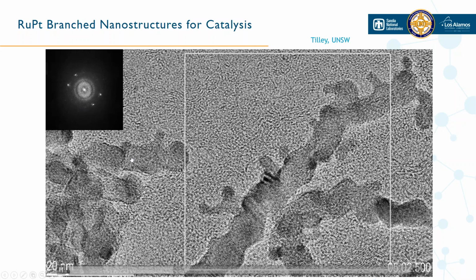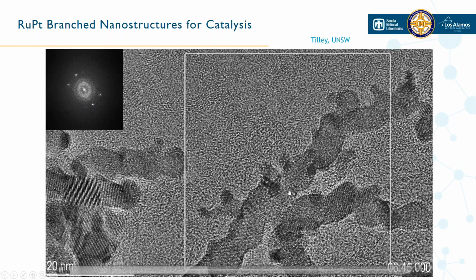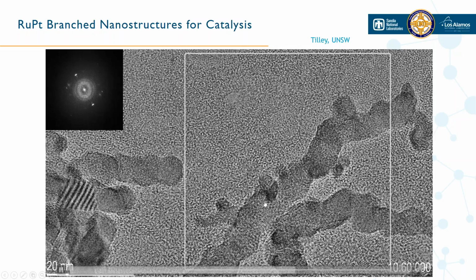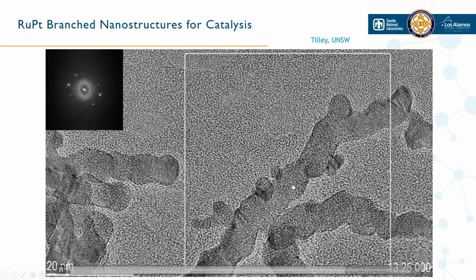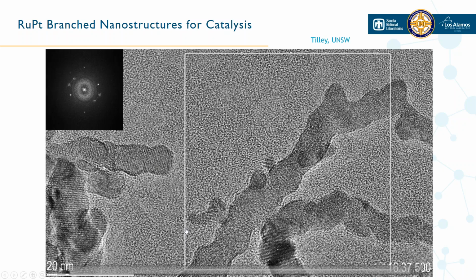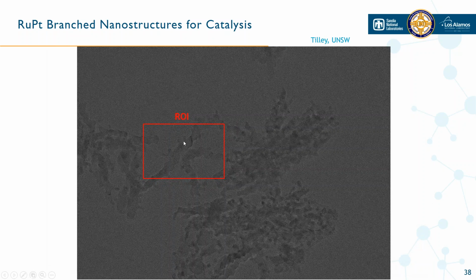So even within this small ROI, you're seeing a number of these events, and you're getting atomic resolution, well, lattice plane resolution in this image at least of these nodes annealing. So even within this, you have a number of events that you can choose. And then if you look at this image here, you have all of this information here still to be processed. So we really are now looking at statistically significant amounts of atomic resolution transformations within the ETEM, which is just fantastic.